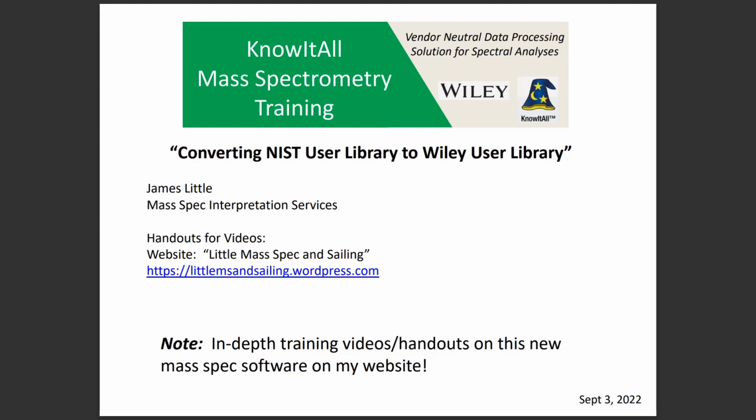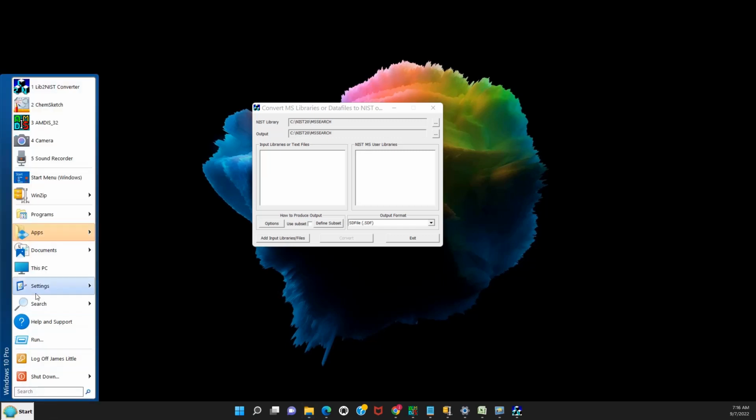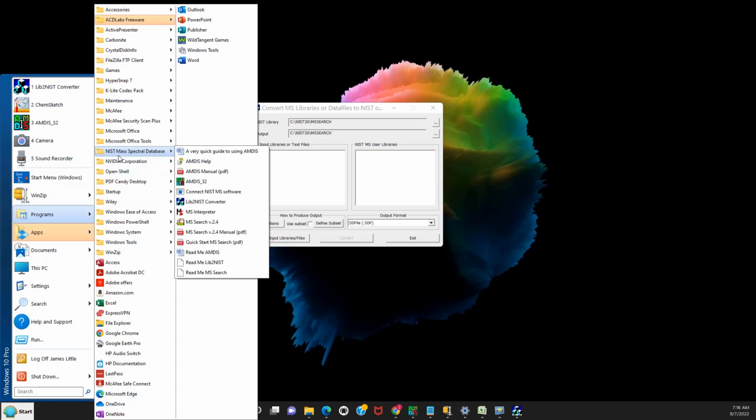Today I would like to share with you some information on converting NIST user libraries to a Wiley user library format. This is part of a series of training videos on using the Wiley KnowItAll software, which can be found on my personal website. The conversion is performed with the lib2NIST utility program, which can be found in the program files for the NIST mass spectral installed software, as one can see here.